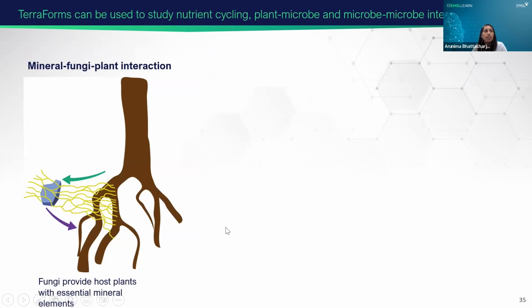Okay, so Jade gave a really nice introduction about how we can customize these platforms for adding different types of minerals, and also customize them for mimicking the soil aggregate structure, porosity, etc. So here in this platform, which is called the pore-scale micromodel platform, I'm going to describe to you what we can do when we add minerals to it.